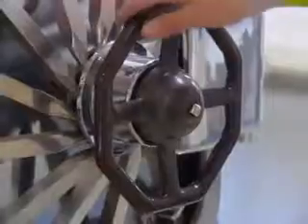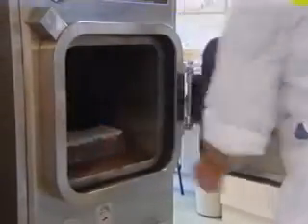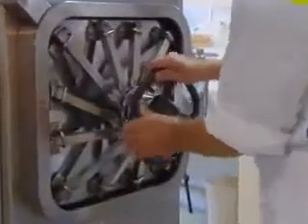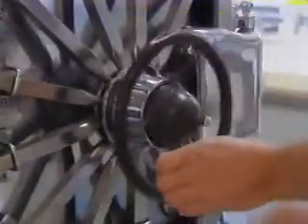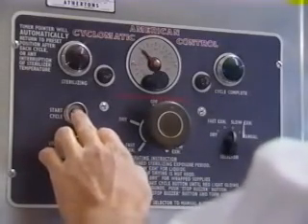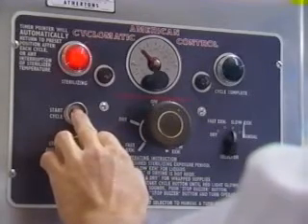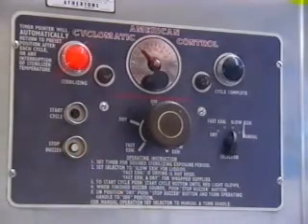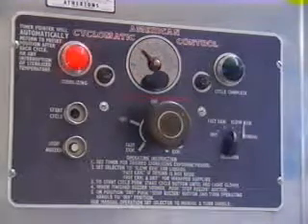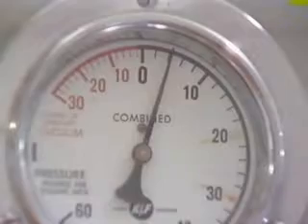For others, the culture vessels are capped and autoclaved for 20 minutes at 121 degrees centigrade at a pressure of 103 kilopascals. This pressure and heat will destroy all microorganisms which are in the medium and the culture vessels. A household pressure cooker may be used instead of an autoclave in small hobbyist operations.